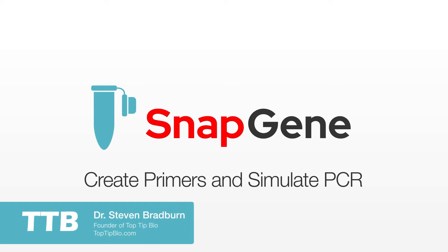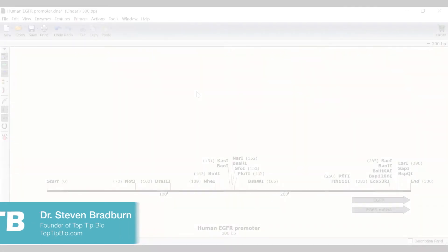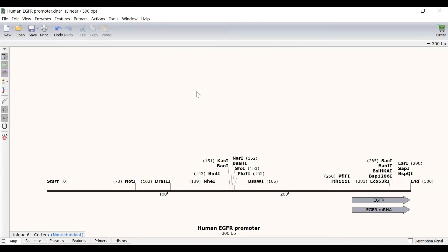In this video I will show you how you can use SnapGene to create primers and simulate a PCR reaction. In this file I have a sequence for the human EGFR promoter region. What I want to do is to design PCR primers that will add restriction sites to either end of the sequence so I can use this fragment in restriction cloning.